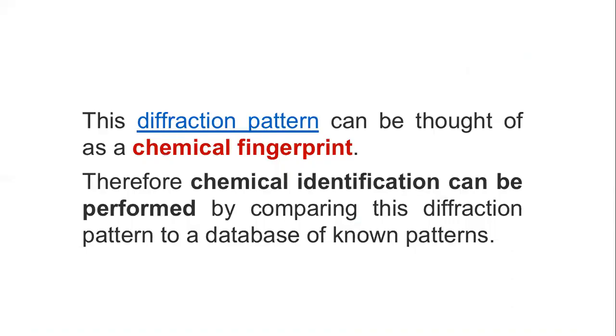That means, in effect, each material will have its own unique X-ray diffraction pattern, and these patterns can be called fingerprints. And if you have an unknown material you want to study, what you can do is go for X-ray diffraction pattern analysis, take the X-ray diffraction pattern, which is considered to be the chemical fingerprint of that particular compound, then compare this diffraction pattern with a database of known patterns, and then you can deduce or find out what exactly your sample is. So that is the importance of X-ray diffraction analysis.